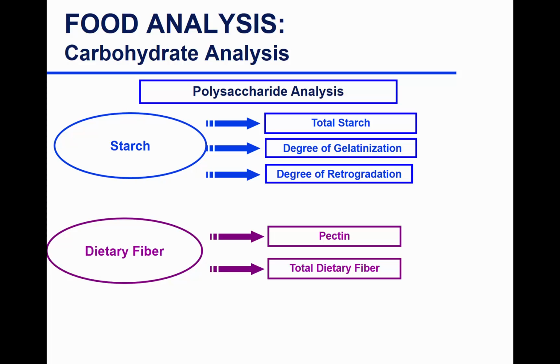It depends on what's published and known, what you have available in your lab, what you're comfortable with using. And sometimes if you're having a hard time with normal phase or reverse phase chromatography, for example, you say, okay, I'm going to do anion exchange chromatography to ensure good separation. So you would just pick a method and try to make sure it works and it's validated and you go with it. There are always tons of methods you can choose from.